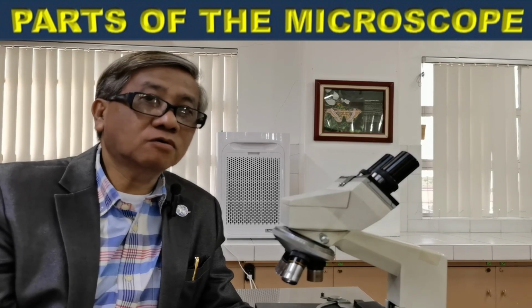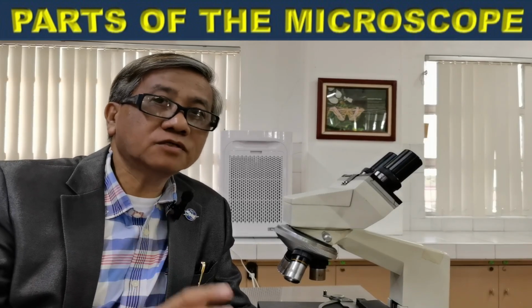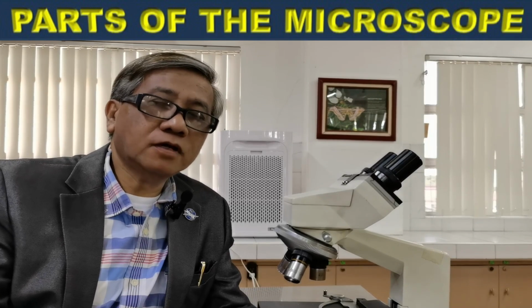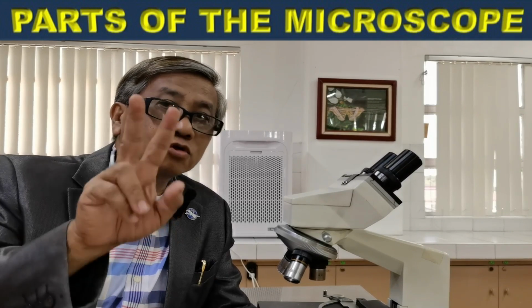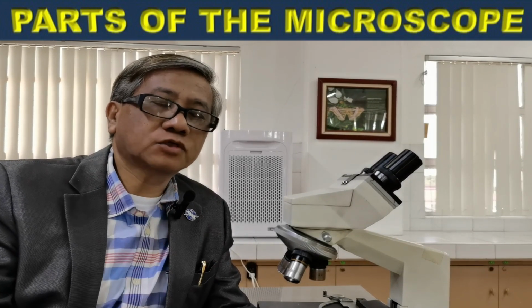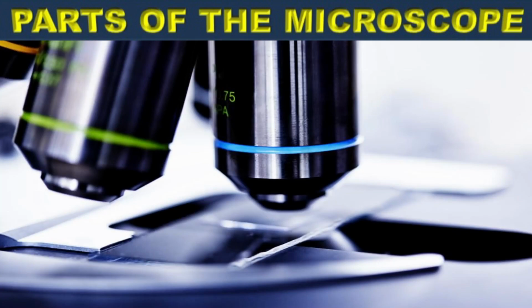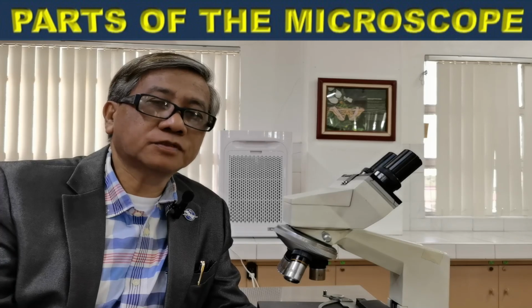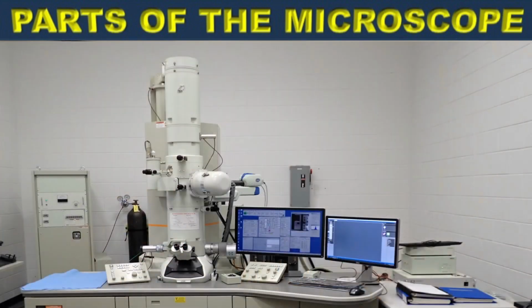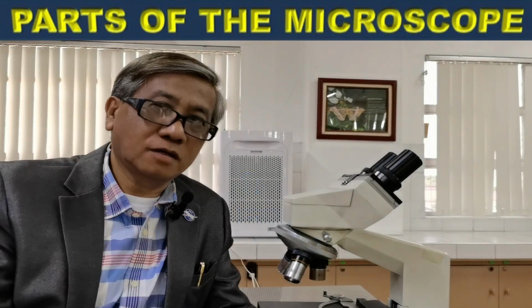Alright, so let us now go into the details of the microscope. Now, a microscope is an instrument that produces a magnified image of very small or minute objects. There are two general types of microscopes. We have the optical microscopes, like this one, that use lenses to produce the magnified image. Then we have the non-optical microscopes that don't use lenses, like the electron microscope. So for this video, we will be focusing more on the optical microscope.